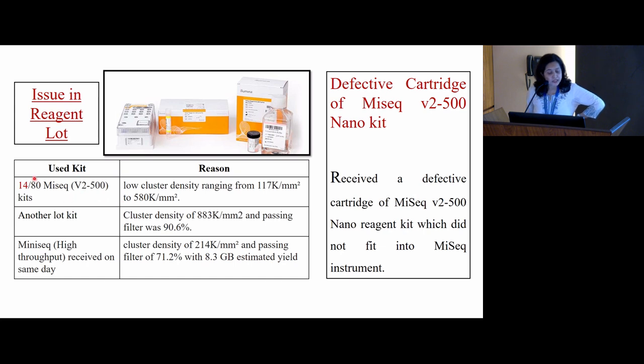Along with these kits, we had also received some MiniSeq kits at the same time, at the same temperature. When we ran those kits with the samples, we got results. It means that it was not a transportation error. The reagents were transported properly.